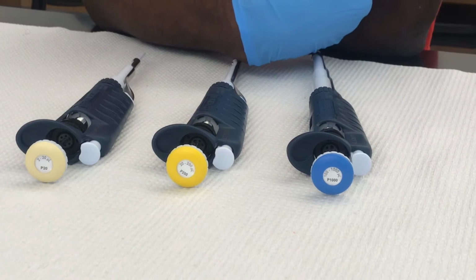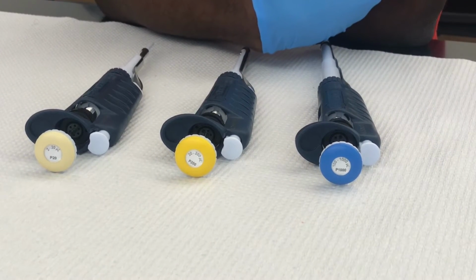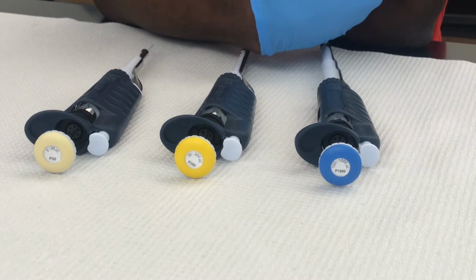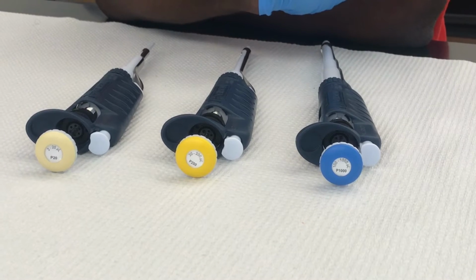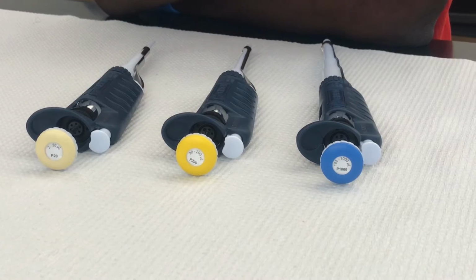For the greatest accuracy, always choose the smallest pipette that will handle the volume you would like to move. Never exceed the upper or lower limits of the micropipettes. For instance, a P200 should not be used to pipette 10 microliters or 205 microliters. Exceeding the limits can result in damage to the micropipette.